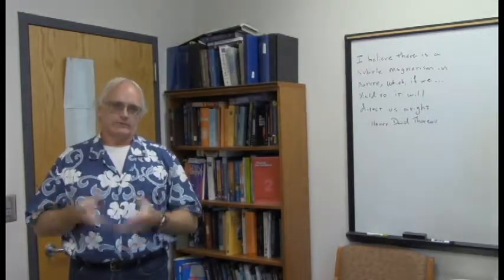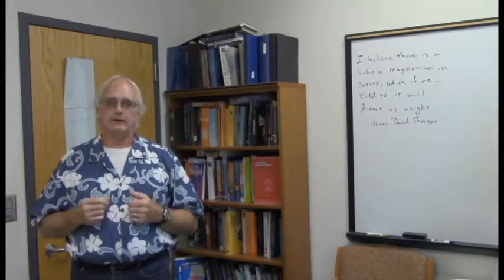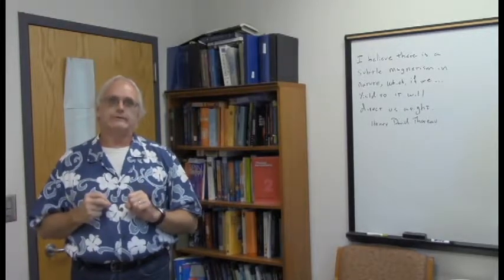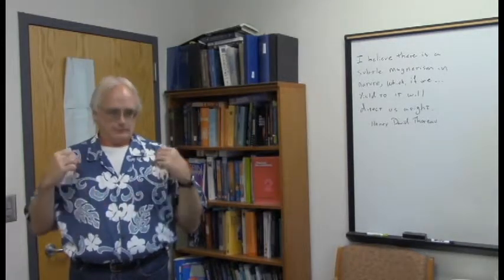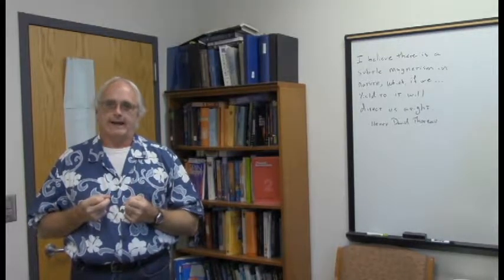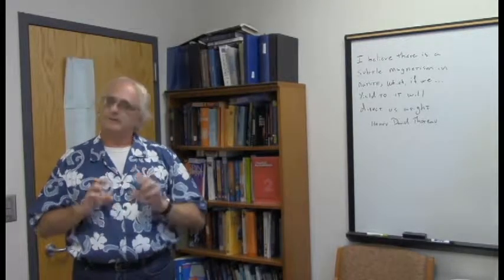It helps make this a little more active learning in this online video experience, which is sometimes difficult to reproduce. I strongly urge you to draw along on a copy of the spectra what you see me doing here, because I think it helps tie together what we're talking about, and it gets you actively seeing some of these correlations for yourself. So give it a try.